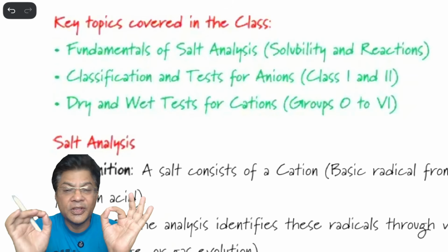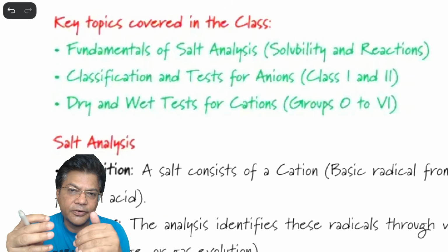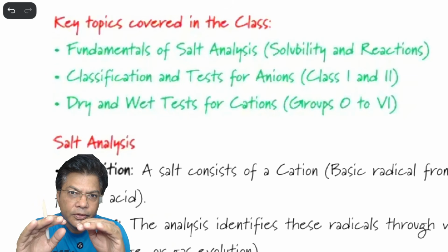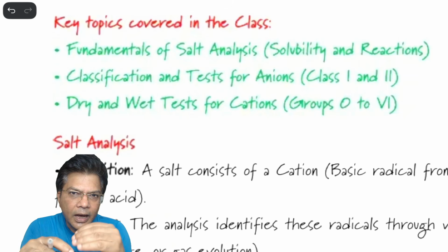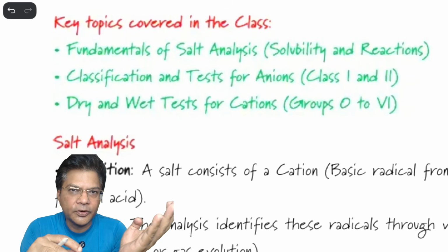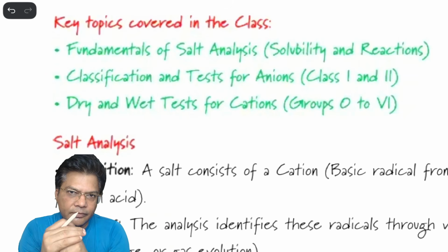If you don't know which is residue and which is soluble, and you are doing the filtration, you should know the filtrate. Just like you are doing filtration of your tea, the filtrate will come down and the residue will remain on the upper side. We are going to have that filtrate as the tea, right?